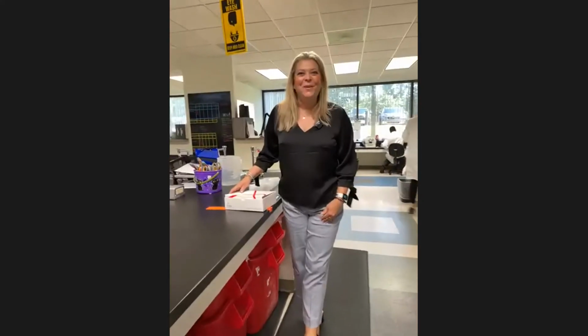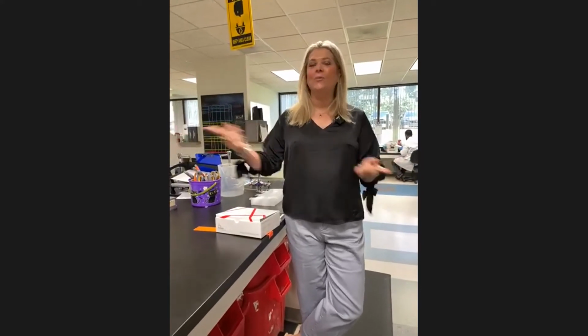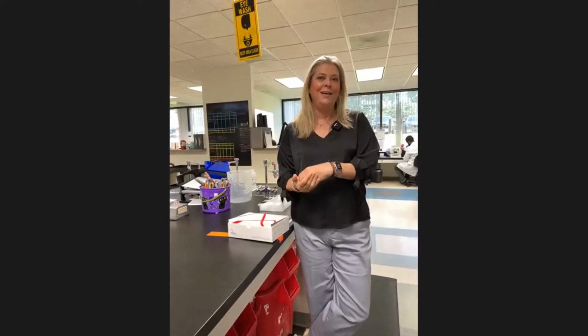All right, hi everyone, I'm Denise. I'm here at Arkana, and we just want to give you a quick look around our laboratory. And like Dr. Larsen mentioned, we want to show you how that kidney tissue becomes a slide, which becomes a diagnosis to your clinician, so that you get the answers you need as quickly as possible.